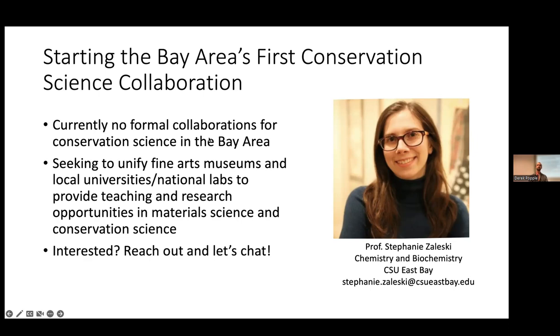And the other question I wanted to ask was, so you talked a little bit about looking at different conditions for imaging, like raising and lowering temperature in particular. I was just wondering what had been done. That seems like the most relevant, in terms of, if you can't reverse the process but you can inhibit it, understanding the conditions, you know, moisture and temperature conditions under which the soaps form. If there's been work done on knowing what those conditions are, it seems like a good place to do experimental work.